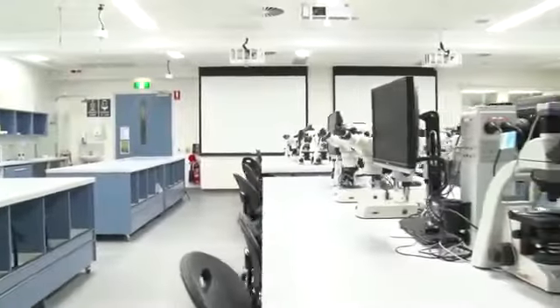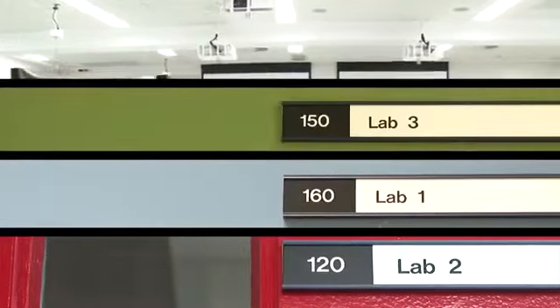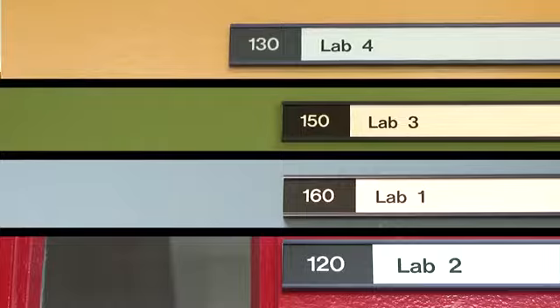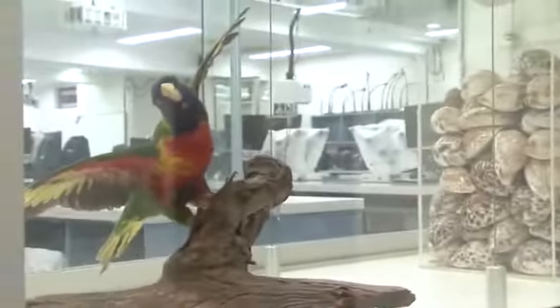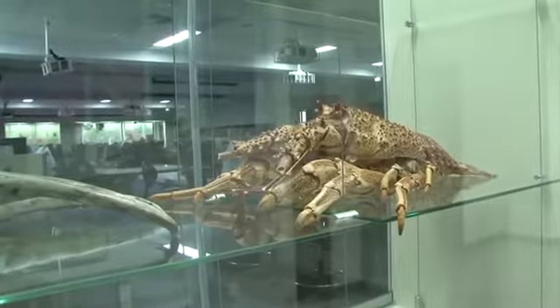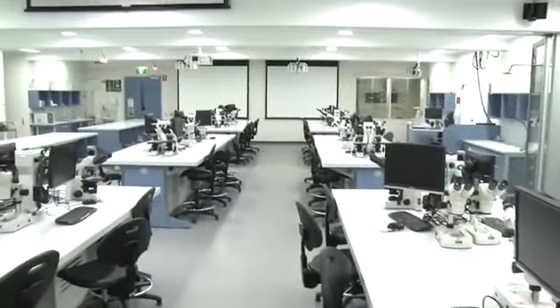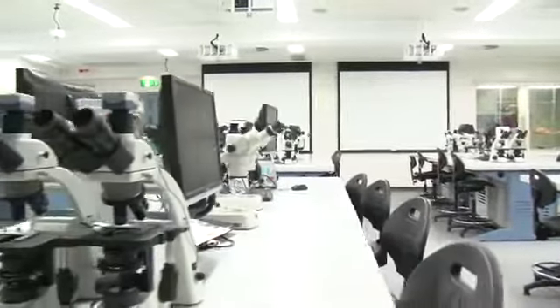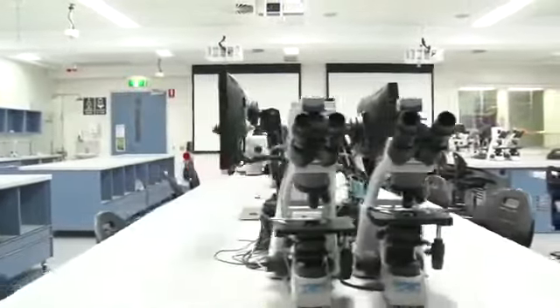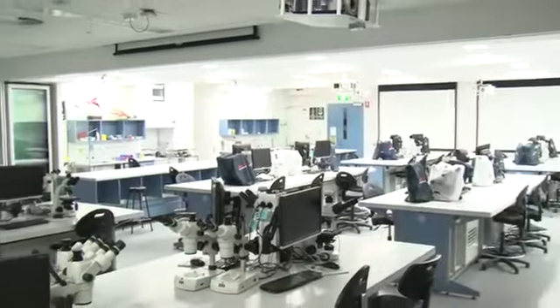Students move into one of four colour-coded labs: red, blue, green or yellow. Themed displays along the corridors outside the labs often display teaching materials reflective of what is being taught within the labs. The teaching labs are modular due to the digital teaching system and audio-visual controls. This allows 4 labs of 32 students to be run simultaneously, or 2 of the smaller labs can be combined to make a 64-student super lab.